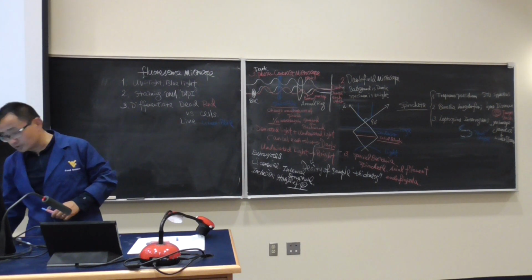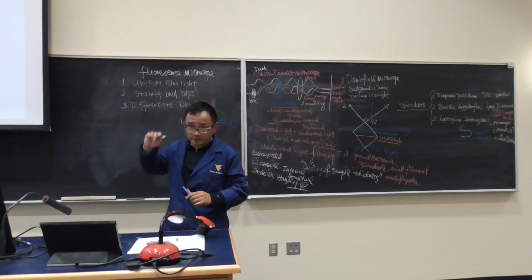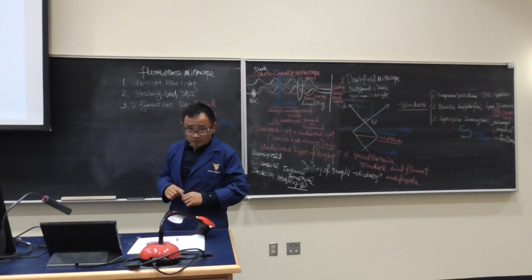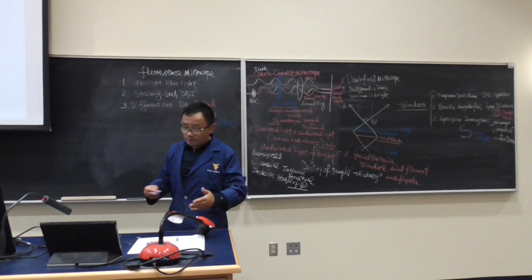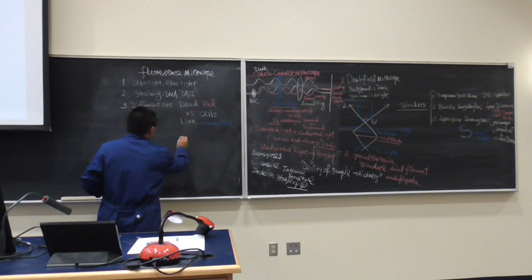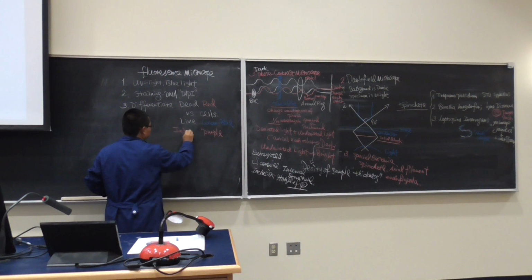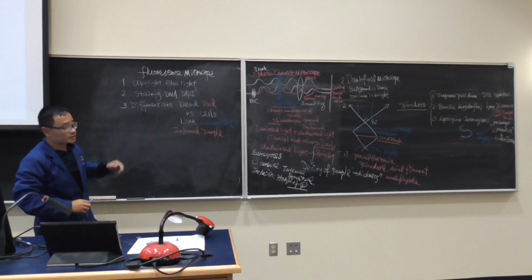And this is what it looks like. Look at the shining blue, green color there. That means it's a live cell. And how about the dead cell? It's a red color. It's dead. Now some people will say, how about the purple color? The purple color may be the injured cell. If you have purple color, that means it could be an injured cell. So that's a good thing for fluorescence microscope.